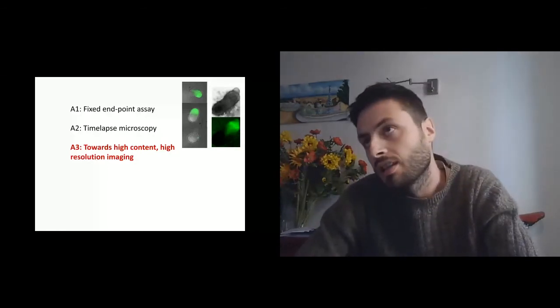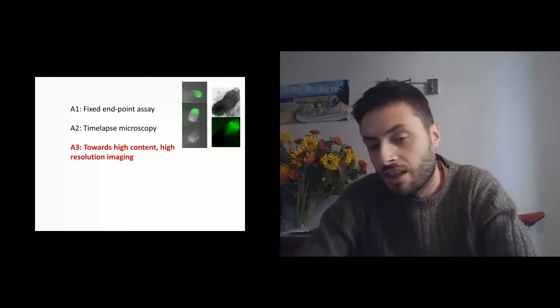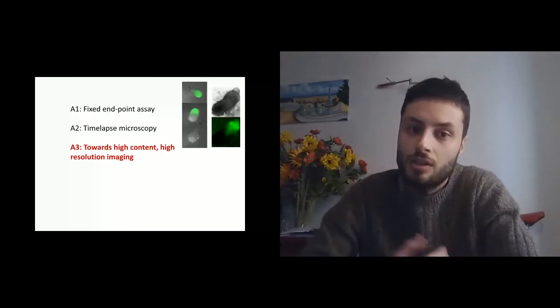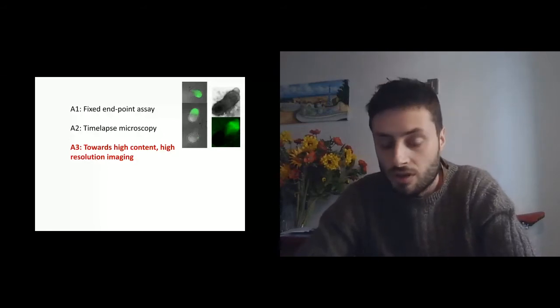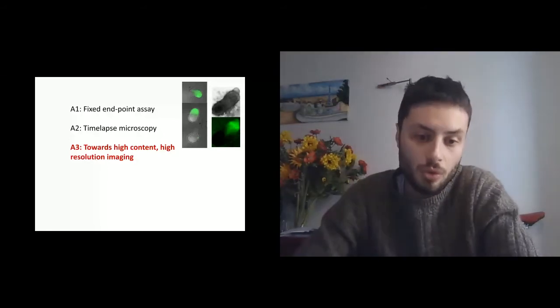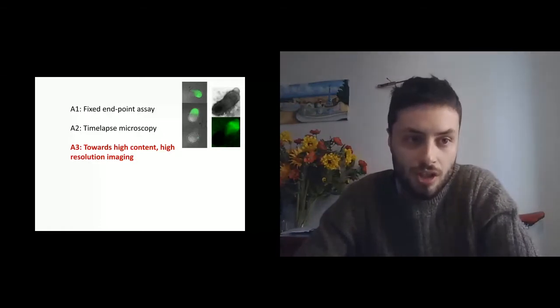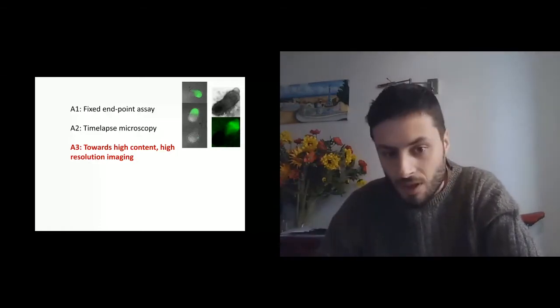But in the case of high content screening, because of the wide field and the confocal nature of the imaging, it is difficult in these cases to avoid phototoxicity, especially when you want to do really high temporal resolution imaging over long-term periods.